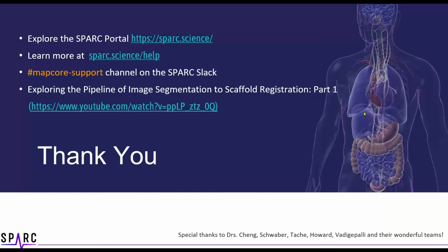I see. Thanks for the question. So really, working with the annotation groups and finding the distinct regions is a collaborative effort. We work with the investigators themselves, plus the SPARC anatomy working groups, in order to ensure we can label and annotate those distinct anatomies and regions.